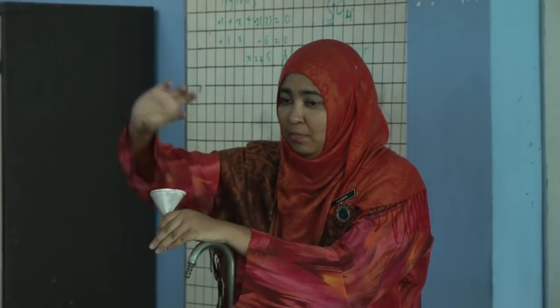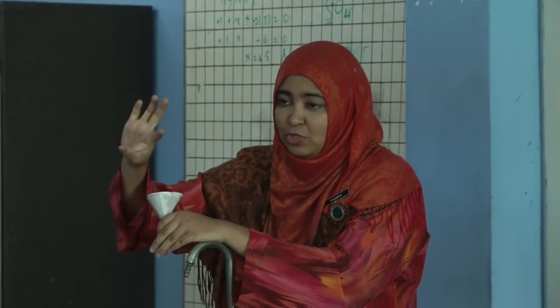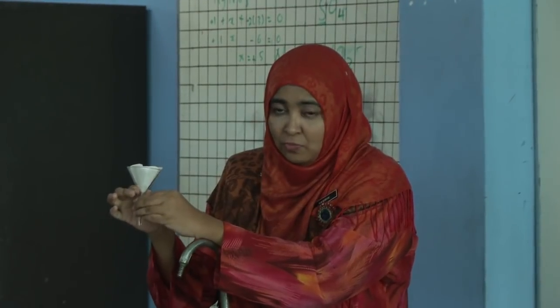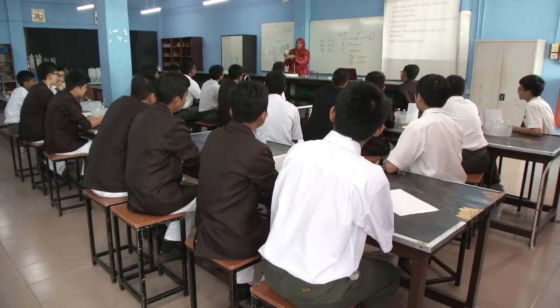And then you place it in the beaker. And then you start to pour. Right? When you pour your two solutions, you pour the solutions into this filter funnel and filter paper. And let gravity do its job. Okay? Clear? Yes. Okay, you can start your experiment now.